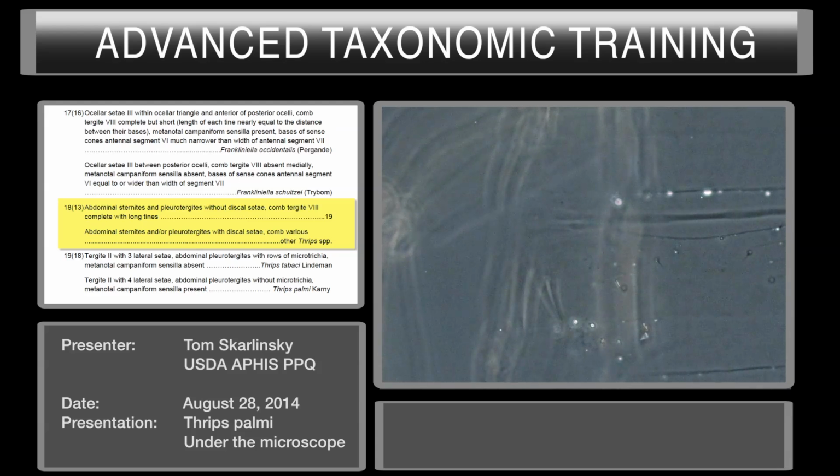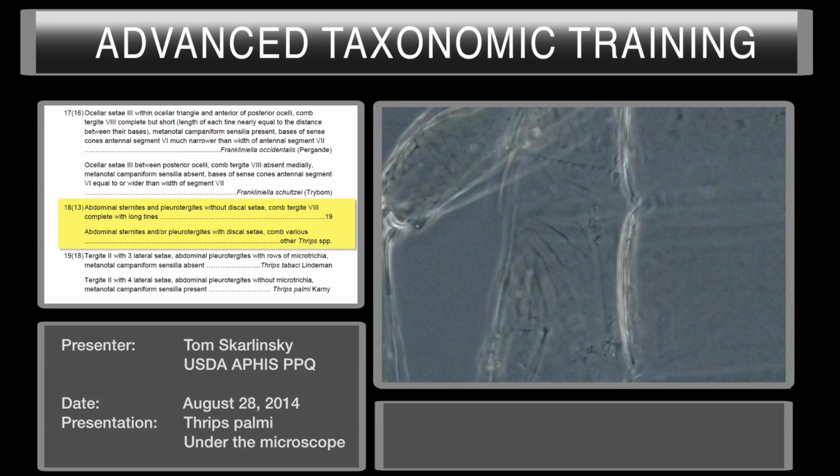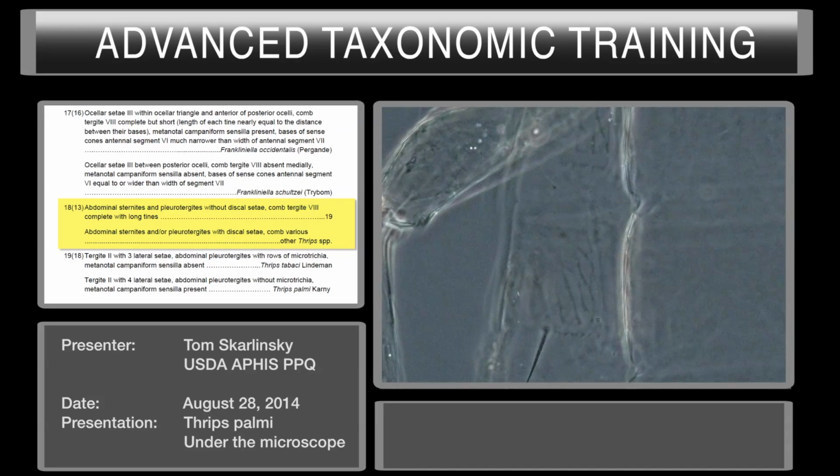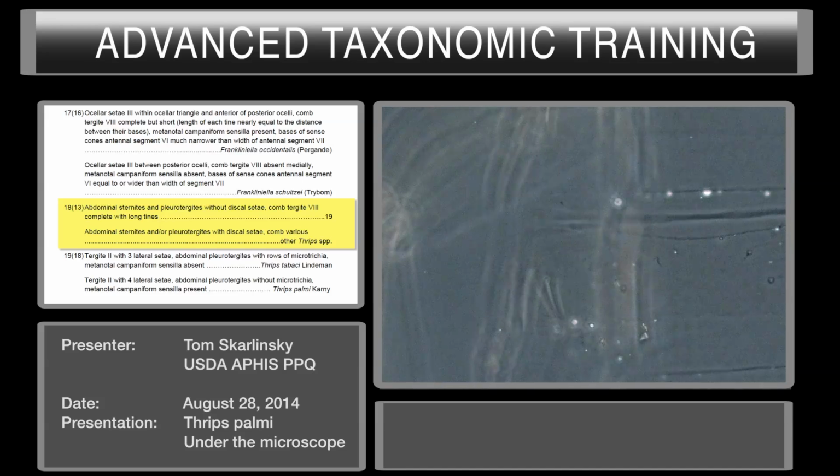Well, what will happen as we change our focal adjustment, we go to the venter more, or we move to the ventral side, you'll see that this same plate, the lines of sculpture, have changed direction.